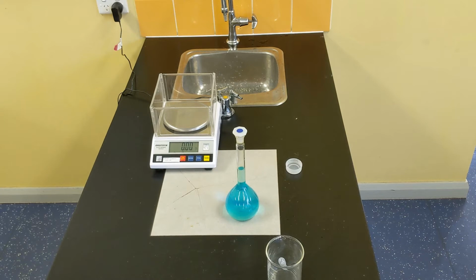So in the last video, we prepared a 250 ml solution of copper sulfate with a concentration of exactly 0.1 moles per liter. Now in this video, we're going to be doing a dilution. What that means is we're going to be taking some of that liquid, putting it into another volumetric flask. We're going to be measuring that amount of liquid exactly. And then we're going to be filling the rest of the volumetric flask up with water to dilute our solution, thus reducing its concentration.